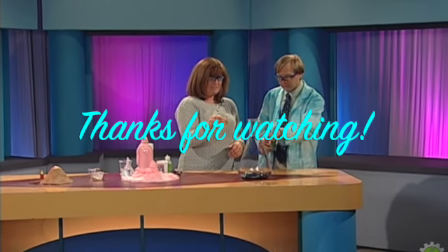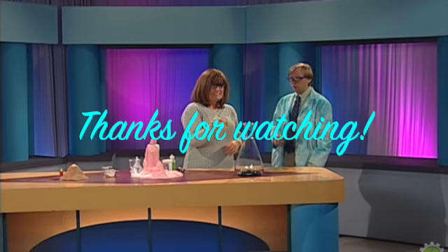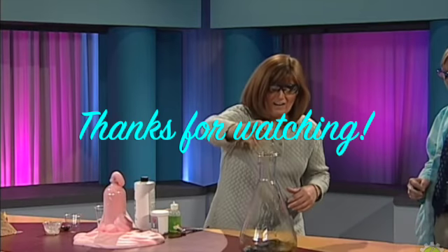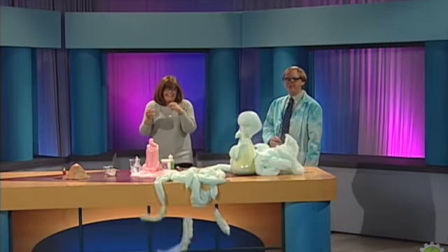I'm ready. All right, keep your eye on the gigantic flask. Okay. All right, here we go. Ready? 1, 2, 3. Pour. Step back. Oh, look at that foam. Now that is science. Wow, look at that.